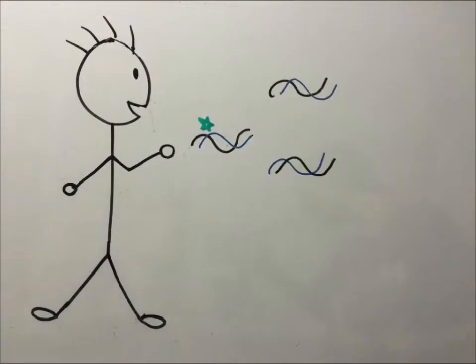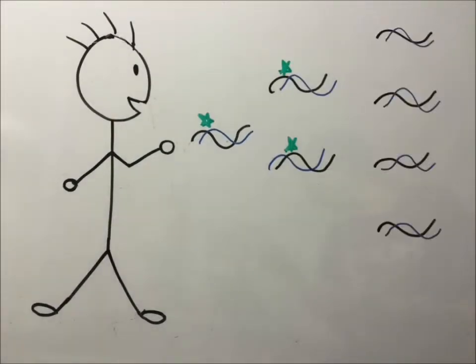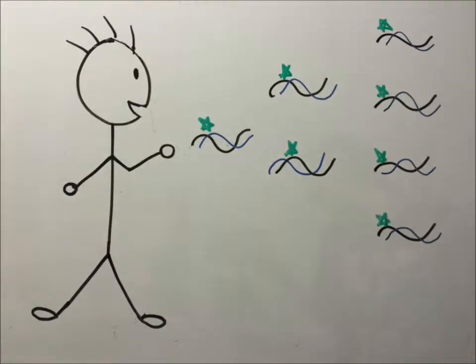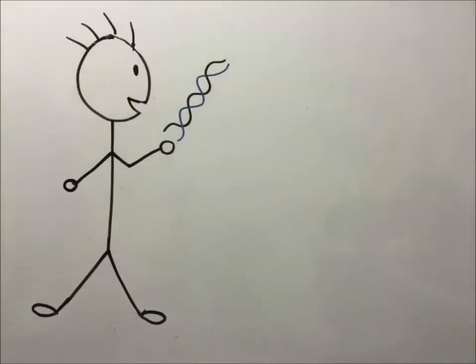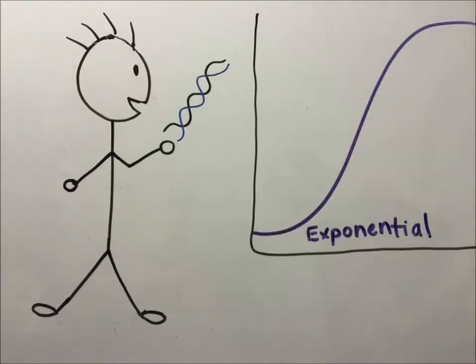A qPCR mix includes a fluorescent dye to bind the double-stranded DNA. The dye is excited by a light source, and as DNA is synthesized, a detector records the increasing signal. A qPCR experiment consists of 3 phases. However, the reagents are abundant within the exponential phase, providing the best window for accurate quantification.